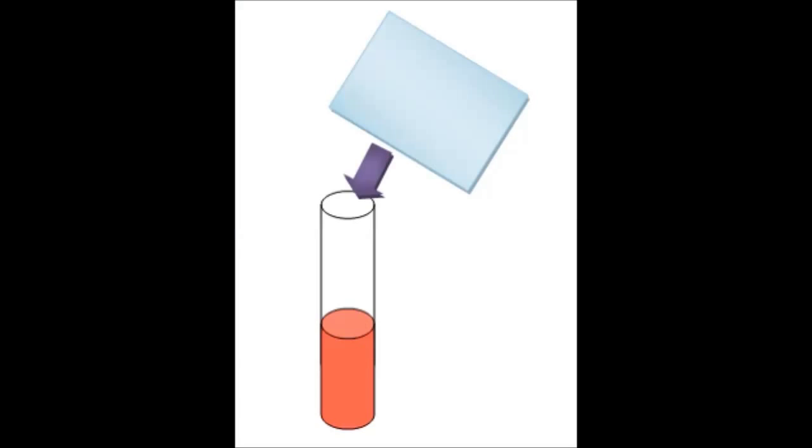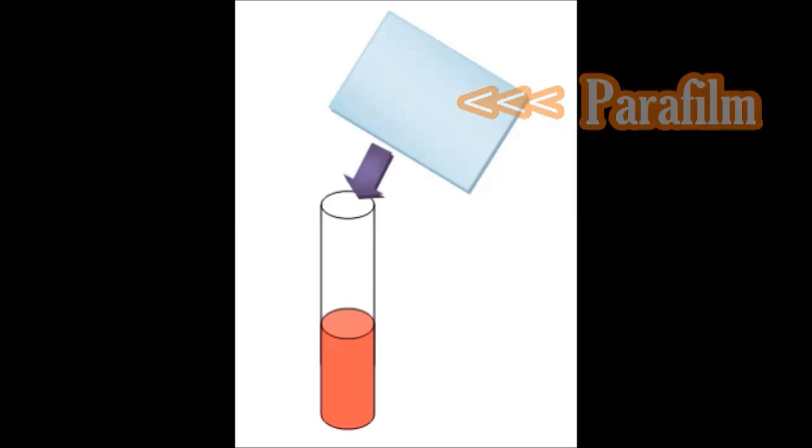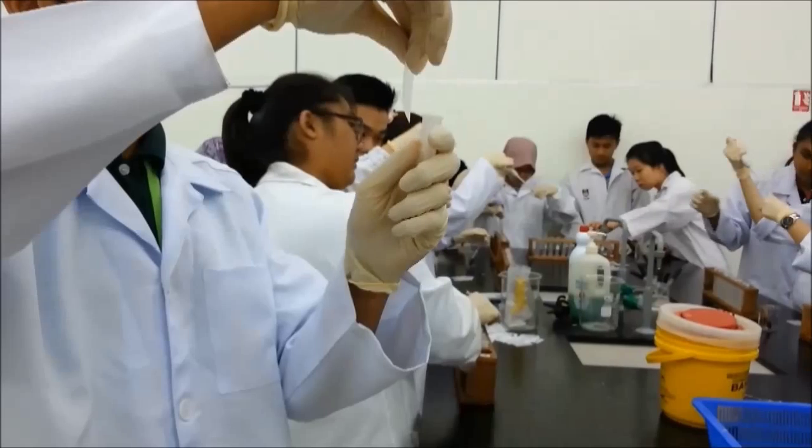Each test tube is then covered using parafilm, and the mixtures are gently mixed.